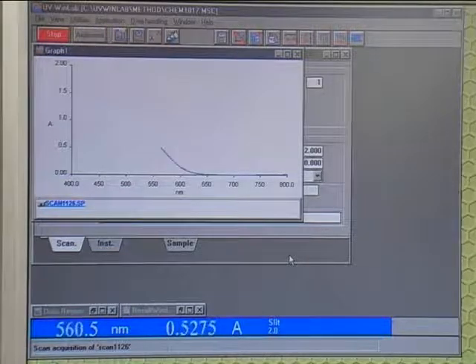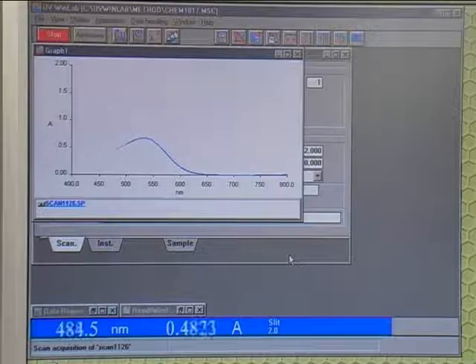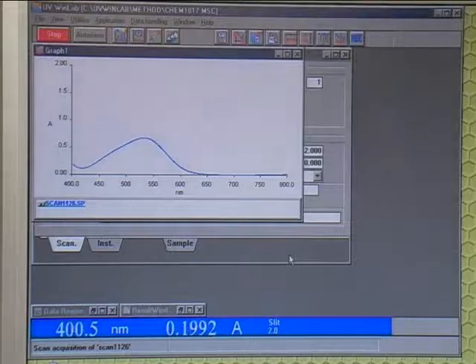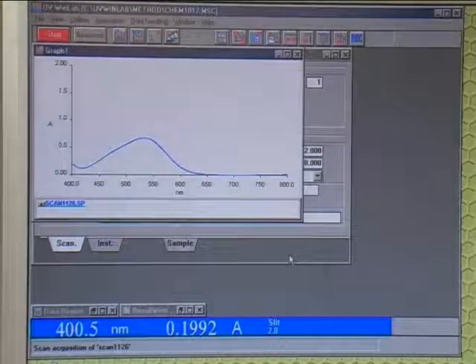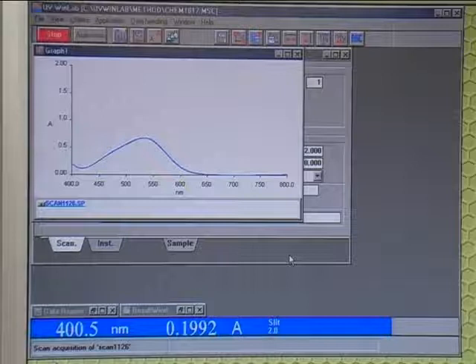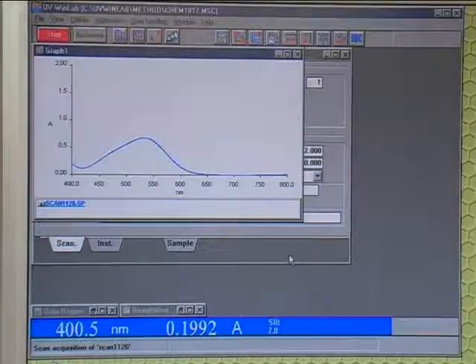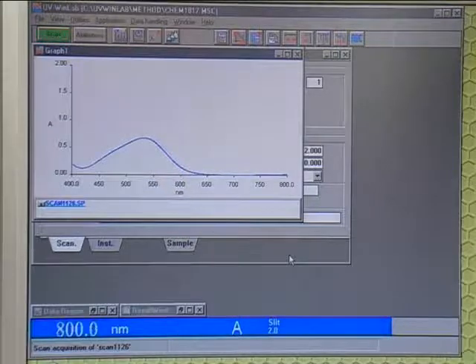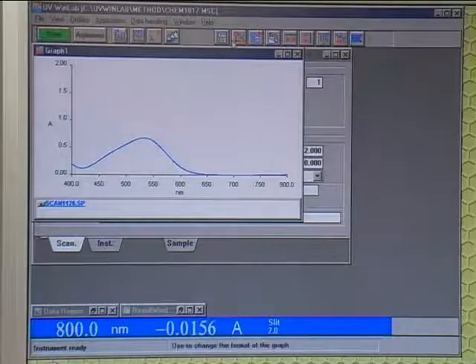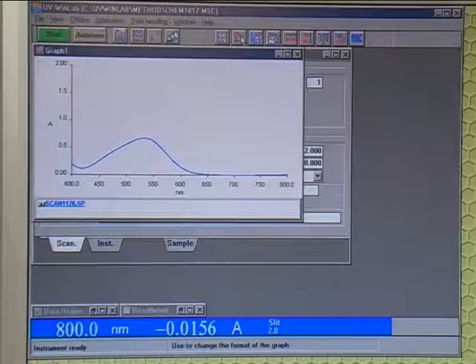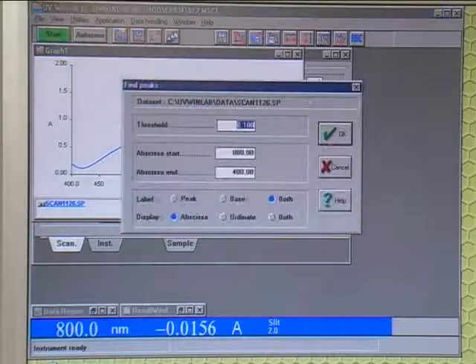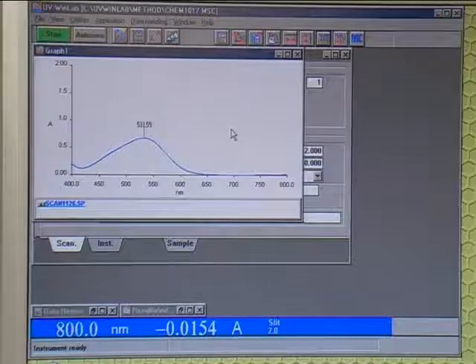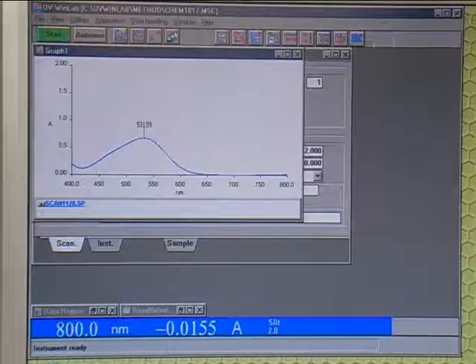Try to ensure that the concentration of your solution isn't too strong, so that the peak goes above the graph, or too weak, so there is no peak. The example shown here is about perfect. Once the data acquisition is finished, add labels using the program, marking the height of the peak and what the substance is.